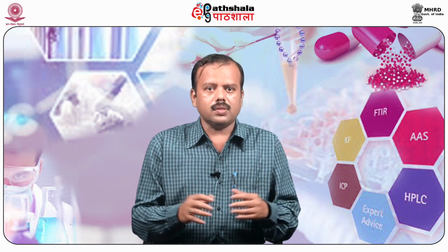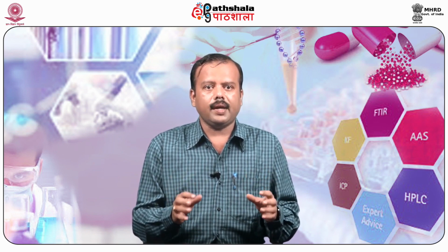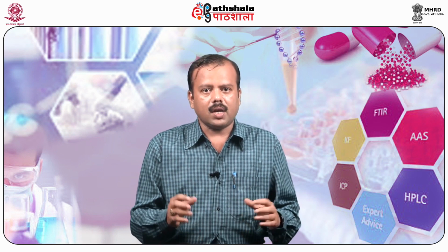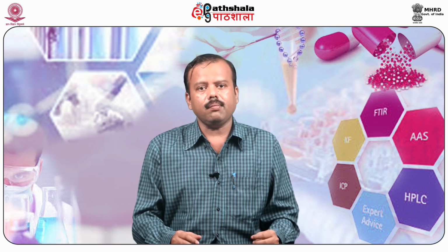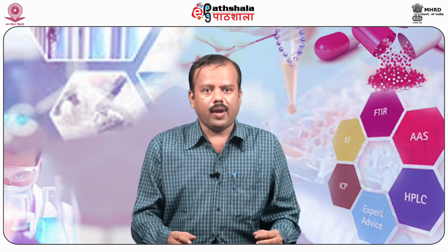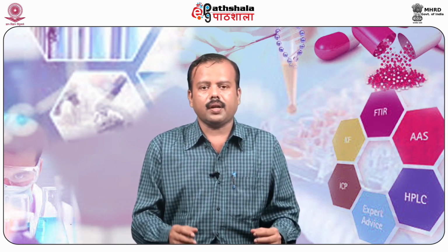The medium used in the test must be standardized because its composition influences the growth rate and development of a specific metabolite pathway. Strict aseptic conditions must be maintained during culture and during medium preparation. In diffusion assay, maximum precision is obtained when the medium and assay solutions have the same pH. Therefore, the buffer must be chosen carefully.